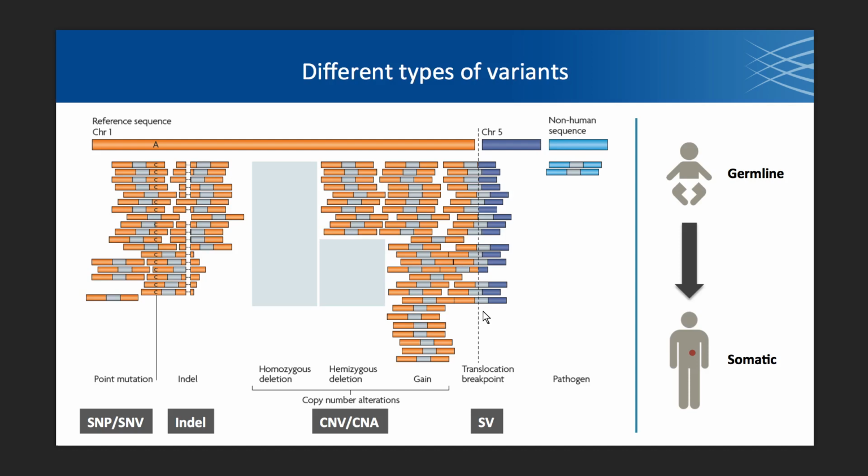Sometimes copy number variations get lumped in with structural variation, but structural variation also applies to a wider class of variants, such as translocations. So Yossi pointed out the example in the cigar for that particular read, that luckily the read and its mate did map to the same chromosome. But if you had a translocation, you would see a lot of reads where the mate was on a separate chromosome, because the fragment that you get from your sample actually aligns to two different chromosomes with respect to the reference.